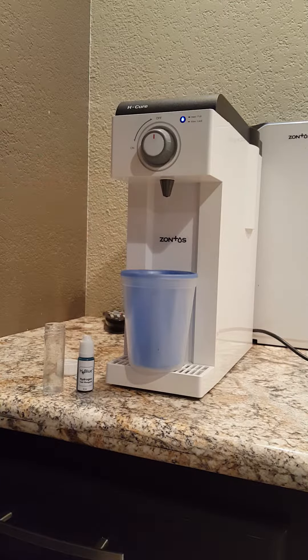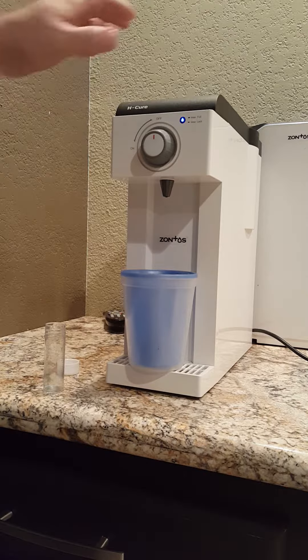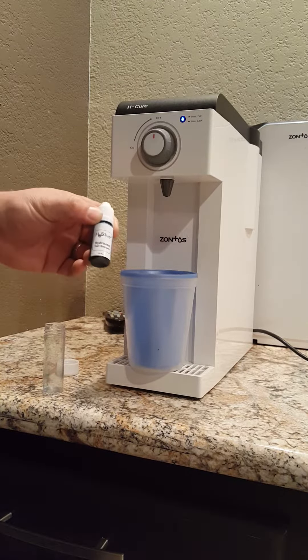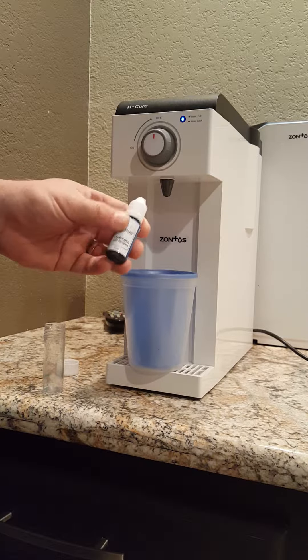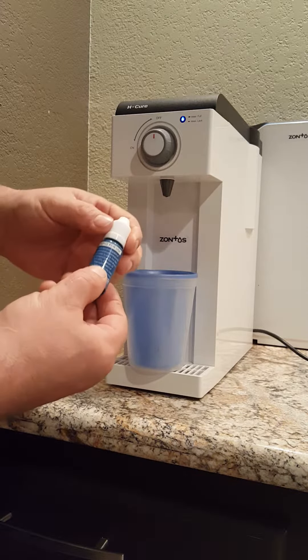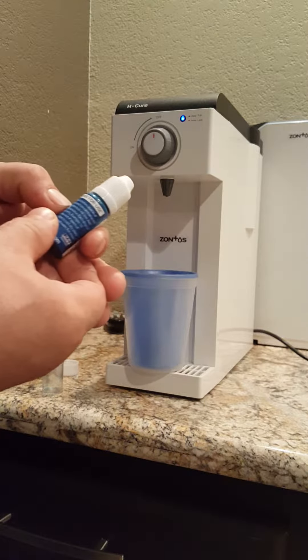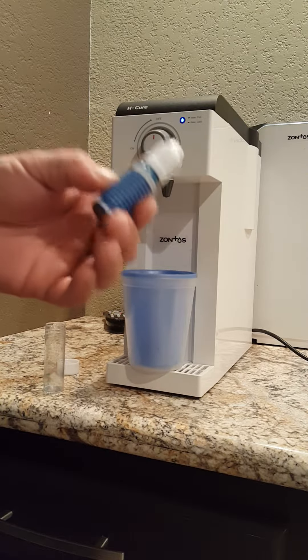Hi, I'm Jason and I purchased an Zontos H-Cure and I found this H2 Blue. It's a hydrogen test reagent and when you read it, it says H2 Blue is a novel redox solution capable of determining H2 presence and concentration.